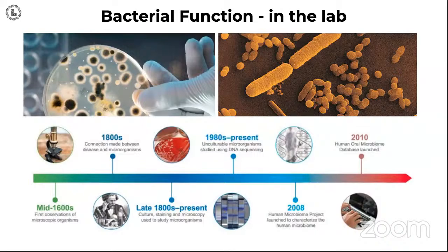But today, with the advent of next generation sequencing, we can study these microorganisms without isolating them in the lab and culturing them. We can actually study the full composition of the communities that they live in. And a big part of understanding those communities relates to the study of the microbiome using computational technology. So when we say metagenomics, we're really talking about analysis of metagenomic data using computational tools.